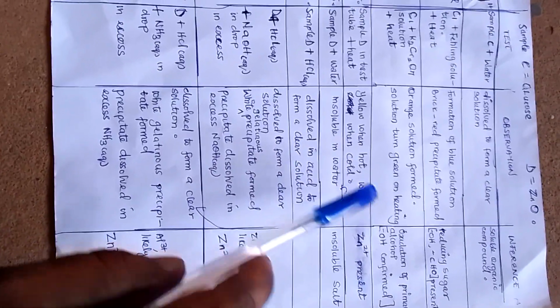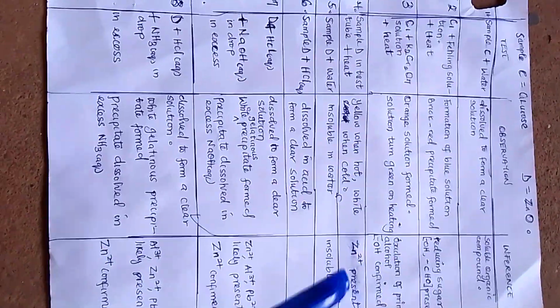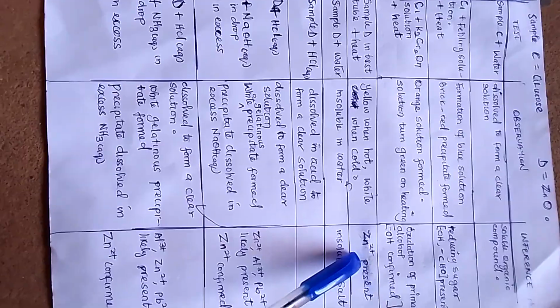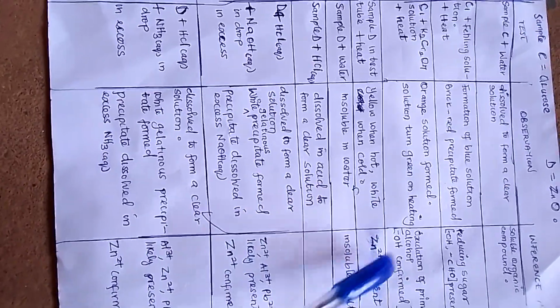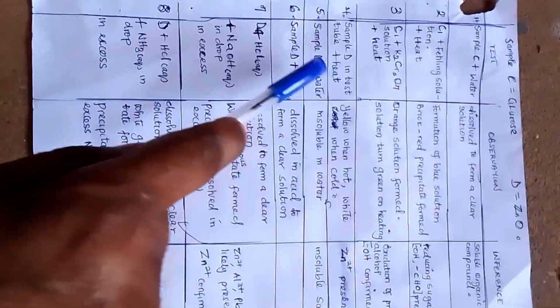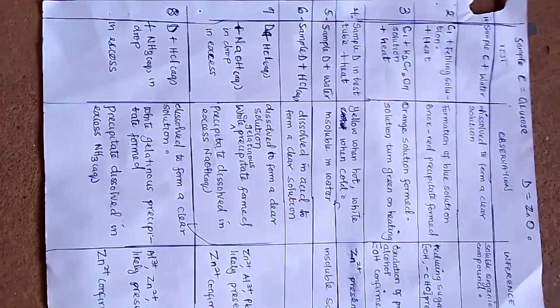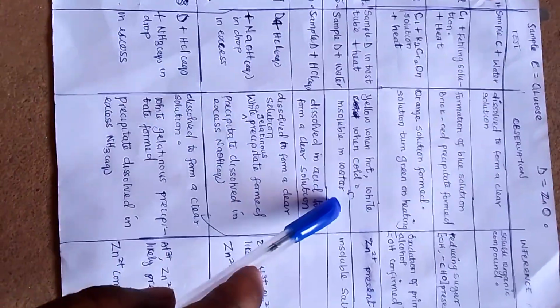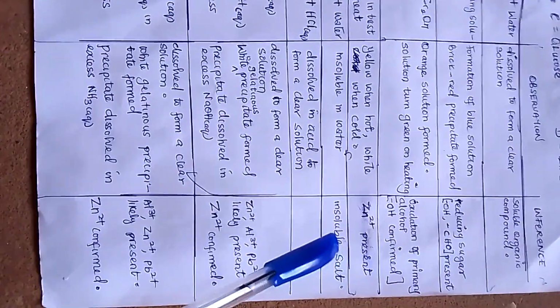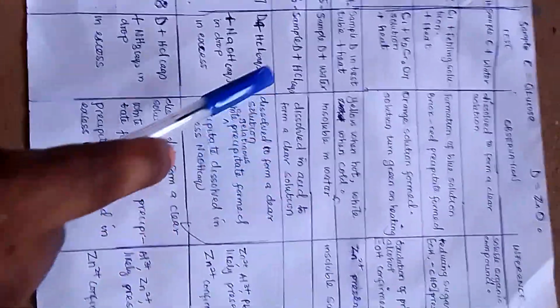You know what amphoteric oxide means? It has basic and acidic properties. When you heat zinc oxide, it changes color in a reversible manner. So that's why the inference here is zinc present. That is an oxide of zinc. Another question might come and say you should put sample D, which is the zinc oxide, and mix it with water. When you mix sample D with water, it is insoluble in water, and that means the inference here is that it is an insoluble salt. So zinc oxide is insoluble in water.